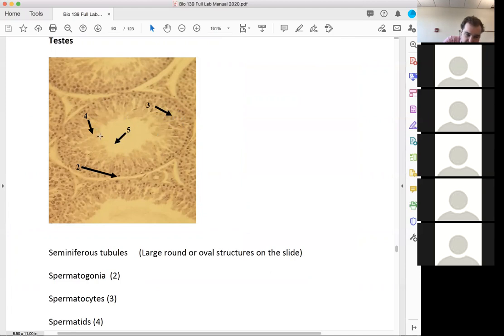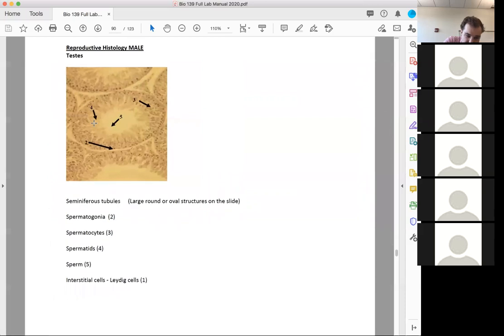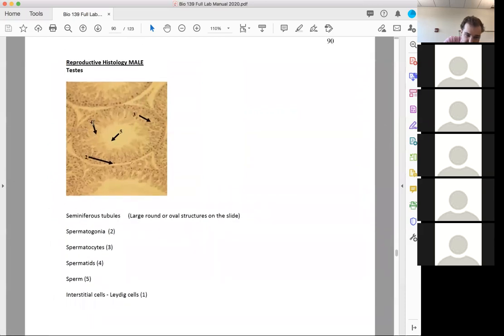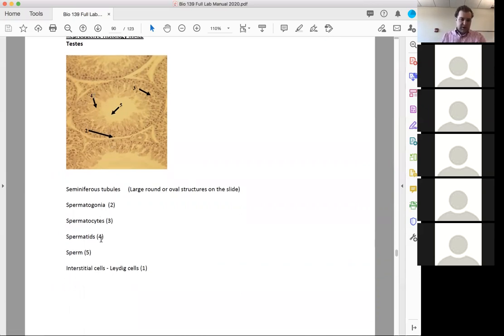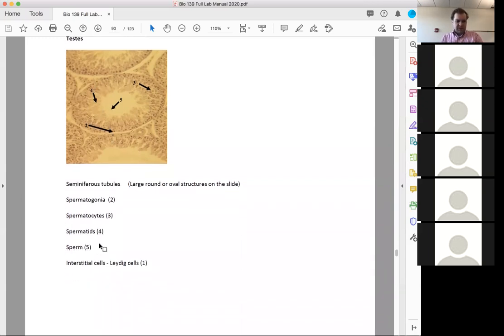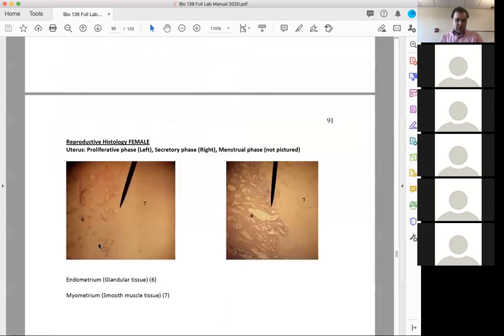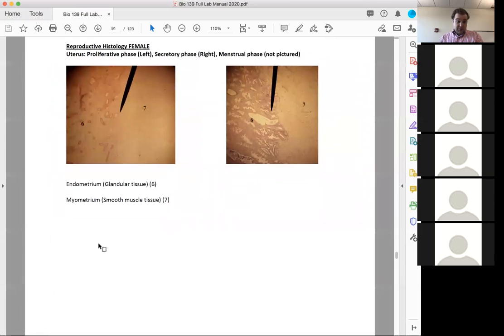And then number 4, we get a little bit closer to the middle, and we get a spermatid. I guess the takeaway here is that the more developed, the more mature these cells become, the closer to the inside of the seminiferous tubule they become. So I will keep a lookout on that if anything like this pops up on the quiz or the exam, because I think students can argue it, and then they would reach a favorable outcome, and I can understand why.